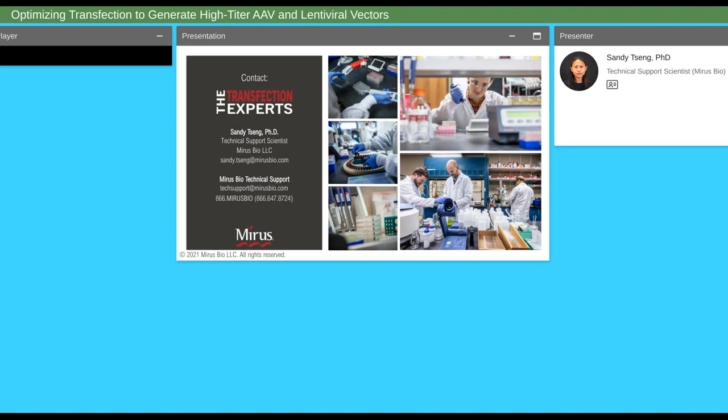Since you know the volume that you applied to the well, you can get a concentration, transduction units per milliliter of sample. So you can design your assay based on what's packaged in your virus. If you don't have a reporter gene, and you want to use flow cytometry, you can use an antibody that binds the protein or gene that's being expressed in your virus.